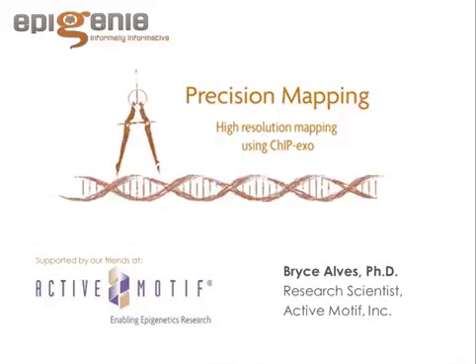The one thing I would warn people about doing that is you have to make sure that your adapters will generate a double-stranded DNA that has a phospho group. That was one of the hardest parts about transferring this technology from what Frank Pugh did with his adapters to the Illumina set, in that Illumina adapters are designed to have a Y shape, but you really want a double-stranded shape. So if you're developing your own adapters, be sure they are double-stranded. And if you want SOLiD-based adapters, I would definitely say look at Frank Pugh's data and use his adapters. That's a good tip. Thanks.